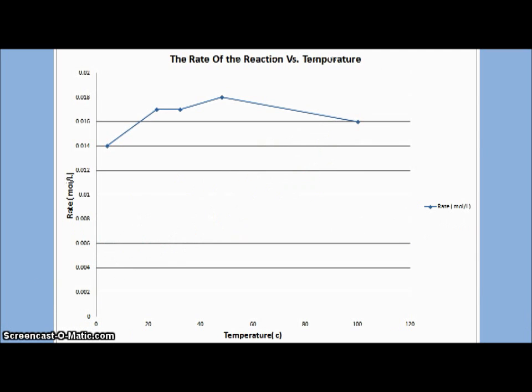Using the 1 milliliter, we tested the absorbance at different temperatures. After graphing, we found the highest rate to be at 48 degrees Celsius. The rate gradually went up with temperature, but when the temperature reached higher temperatures, the rate of reaction went down. I believe at higher temperatures the enzymes became denatured because of the hot temperatures, making them less effective.